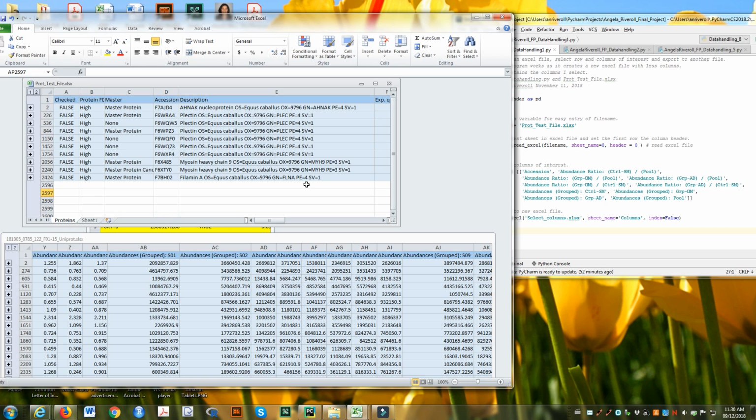In this case, we were looking at stem cells and we added various types of mediums to cause them to differentiate either into bone cells or adipocytes, fat cells. And we did each of these treatments in triplicate and wanted to look at the differences in protein expression profiles between those three conditions. What you see here is the mass spec output, a portion of it.